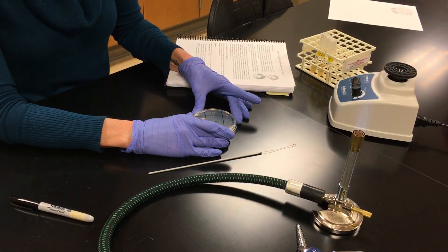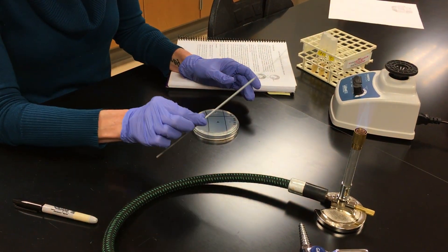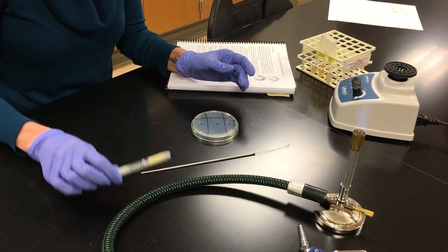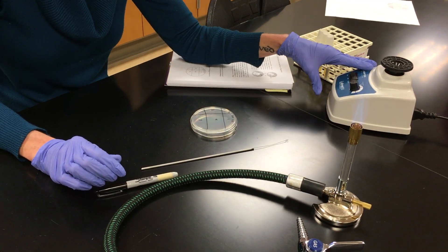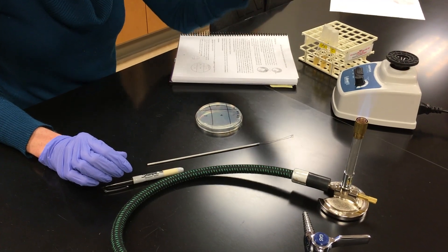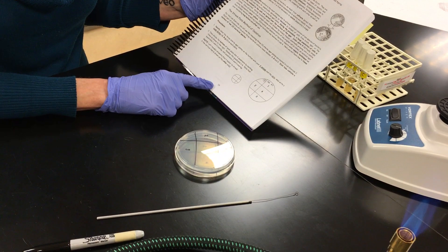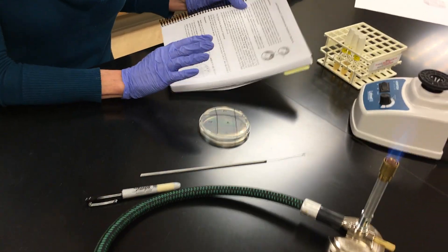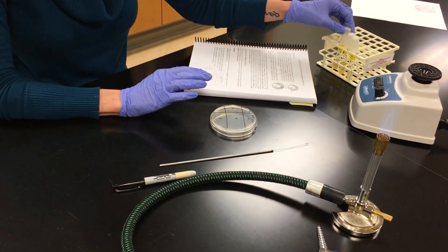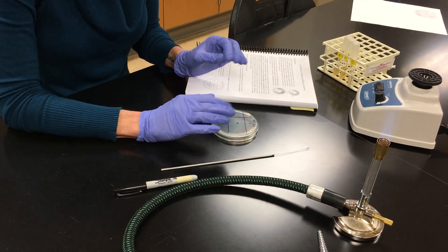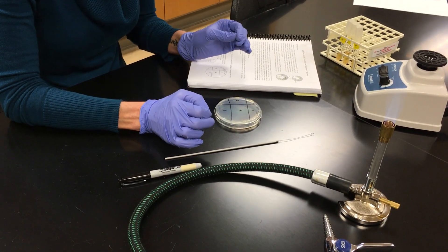You're going to get three different nutrient agar plates. You're going to need your loop, you're going to need a sharpie, and then there are three vortexes that are going to be in the back of the classroom. So we are just going to follow the directions in lab 5 on page 39, and what we're trying to do is we are going to take these mixed cultures, we're trying to isolate individual colonies and create a pure culture.